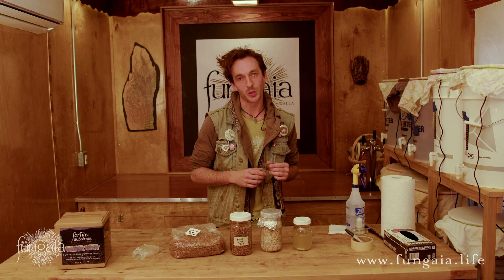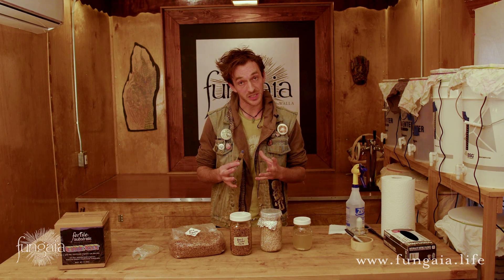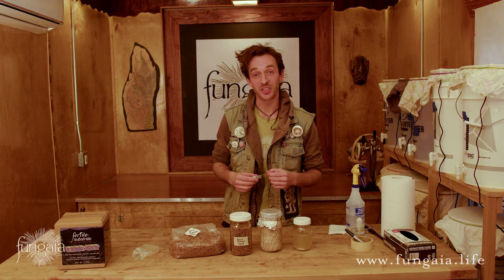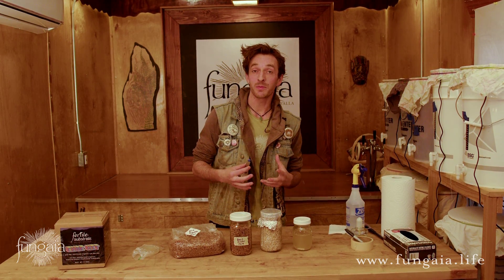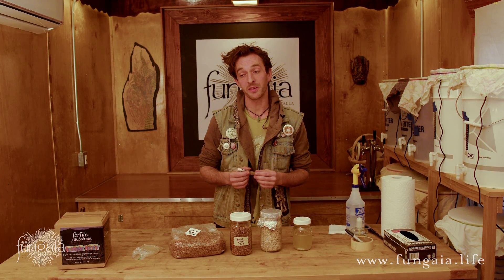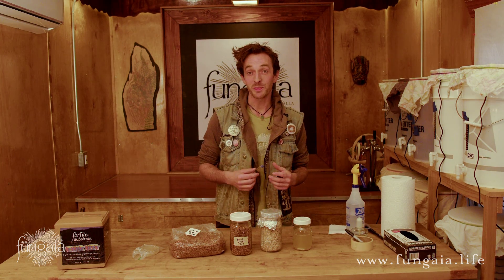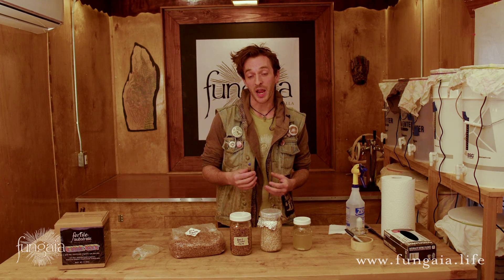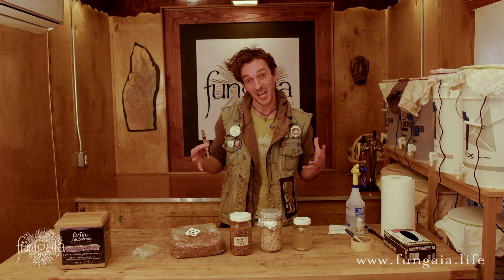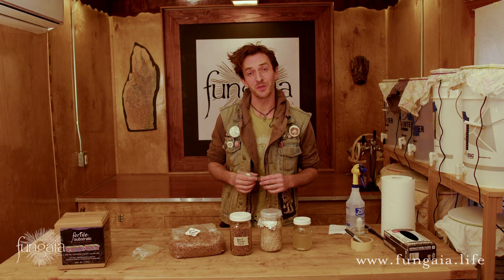One of the many great advantages of liquid culture is that it's remarkably stable. When stored, sealed, and kept sterile in the refrigerator, it can remain viable for many years. This syringe then becomes my backup for my master culture. Any time I want to get more of that particular mushroom strain growing again, all I have to do is pull it out of the fridge, drip a couple more drops onto a petri dish, and I'm off to the races again. With the right techniques, some practice, and a little bit of luck, you can turn one liquid culture syringe into a lifetime supply of mushrooms and build a respectable mushroom culture library for just a few bucks.